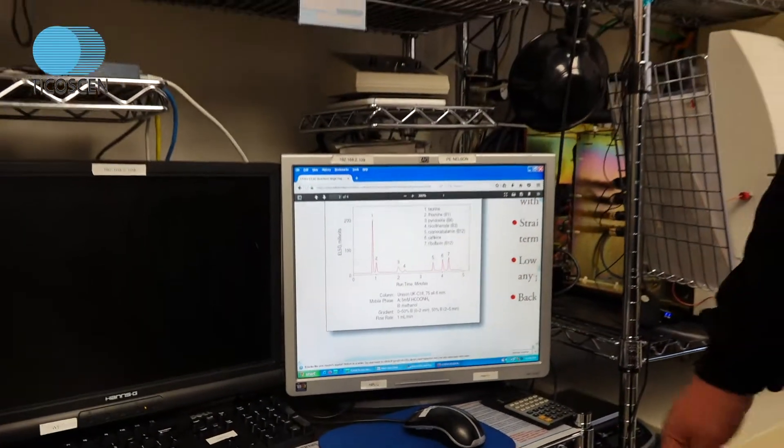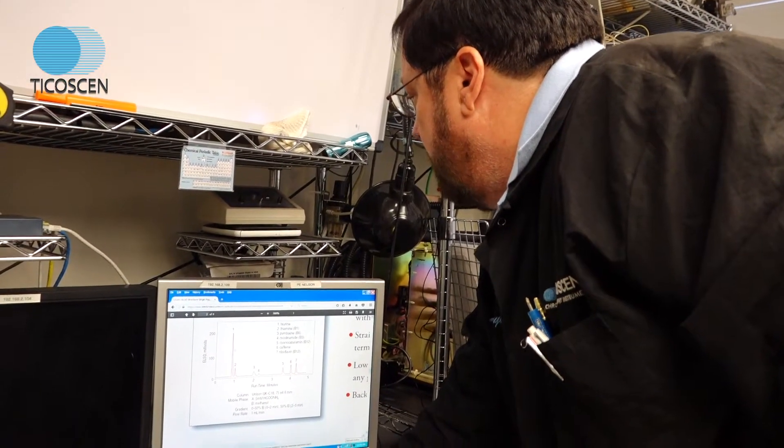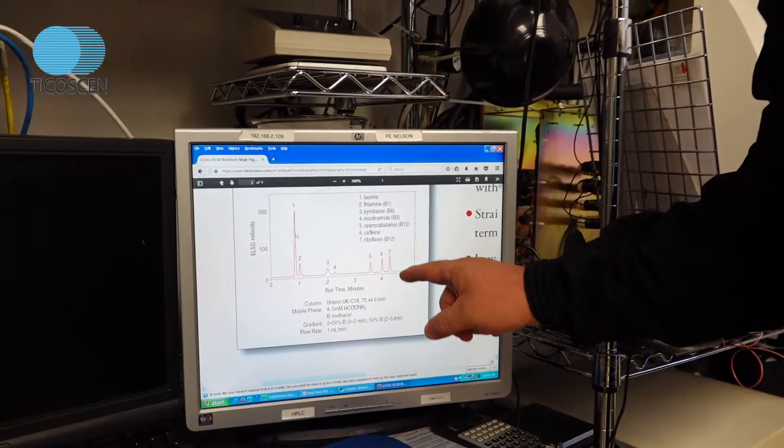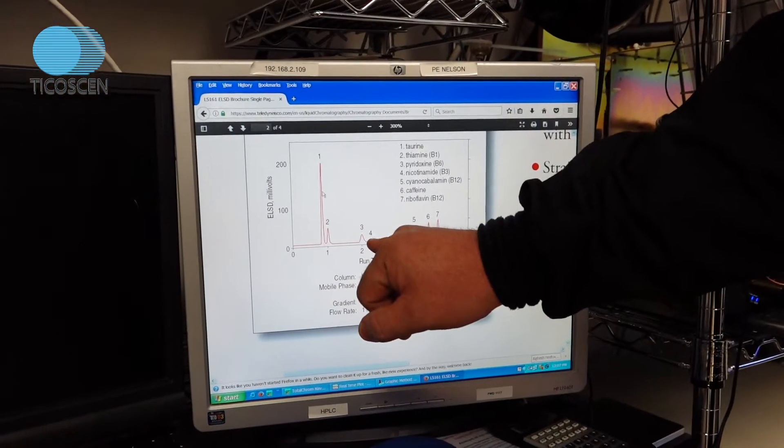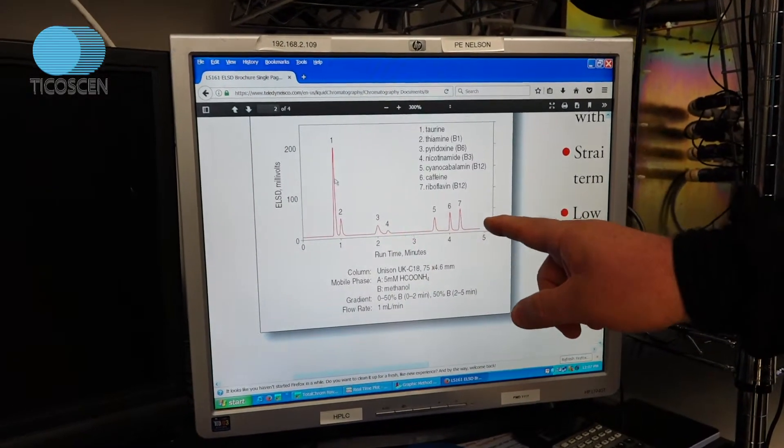So this is a typical ELSD analysis of some compounds that are non-chromophoric. And the larger peak is clearly the major component to this mixture. Your minor component is going to be number four. And your intermediates are two, five, six, and seven.